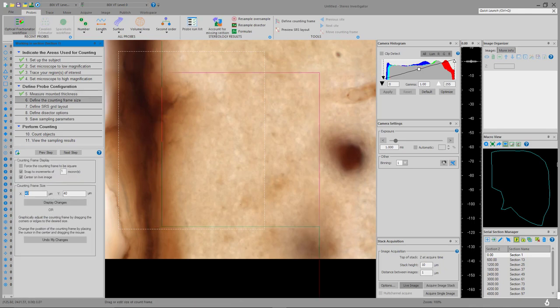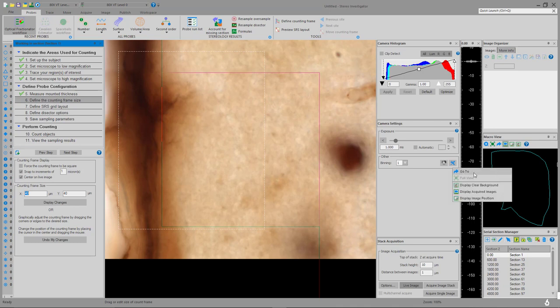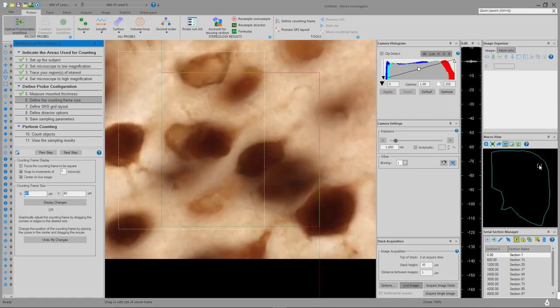Step 6 is defining the counting frame size. This is easiest to do when we're over the region of interest. One of the easiest ways to move around in Stereo Investigator is using the Macro View window — right-click and select Go To, then click on an area to instantly move there. For most projects, you want the counting frame to contain more or less three to five cells in it. We've got a few more than that here, so this might be a little large, but I'll go with a 40 by 40 size.